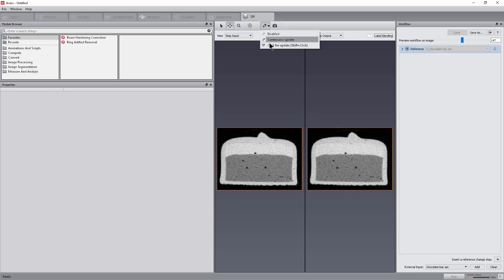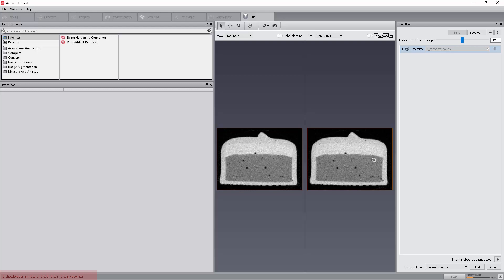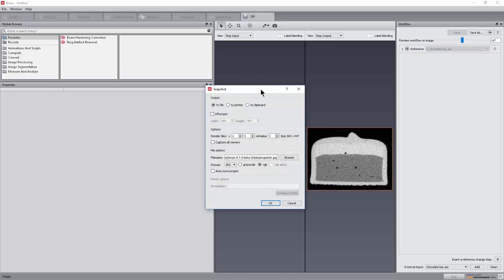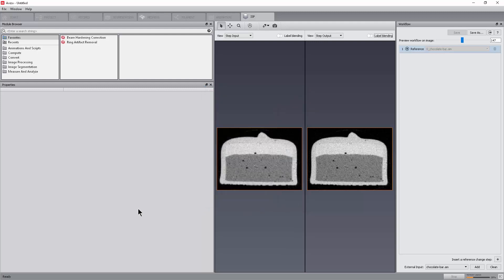Evaluate the value of a pixel under the mouse with the Quick Probe tool. We can create snapshots of the views using the Snapshot tool. Note that the Capture All Viewers checkbox will allow creating a snapshot of only one or both viewers.